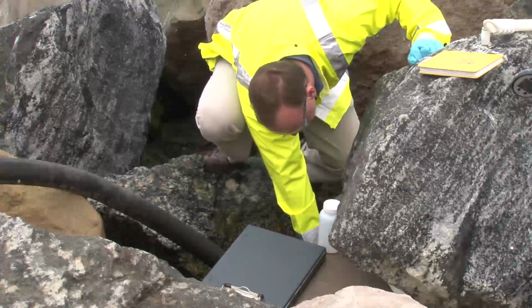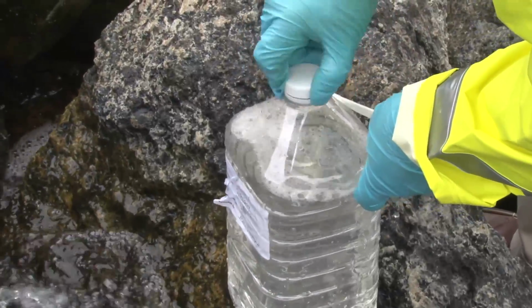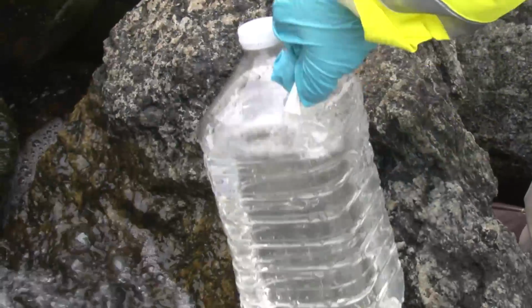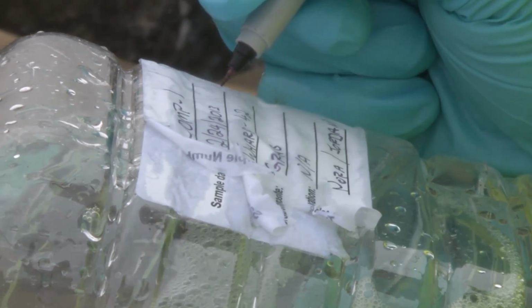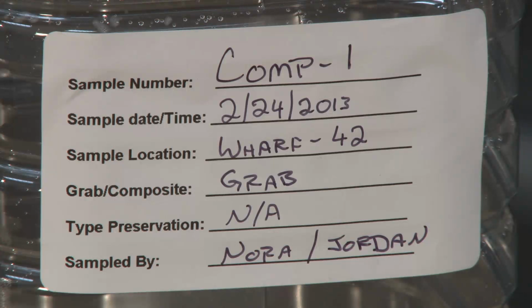Collect samples at 20-minute intervals for the first 3 hours of the storm or until the precipitation stops. Collect those samples in exactly the same manner as the previous ones to ensure representativeness. Properly mark each container 1 through 9 and tightly seal it. Please note that if the flow or storm event does not last 3 hours, you may have fewer than 9 containers. If this is the case, simply mark and seal the containers for the samples collected.